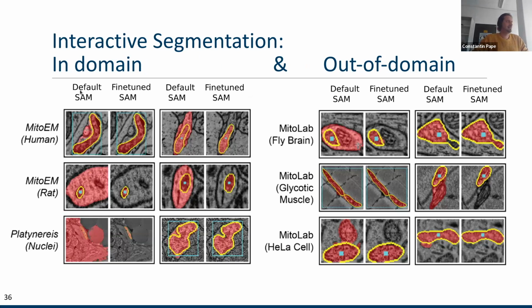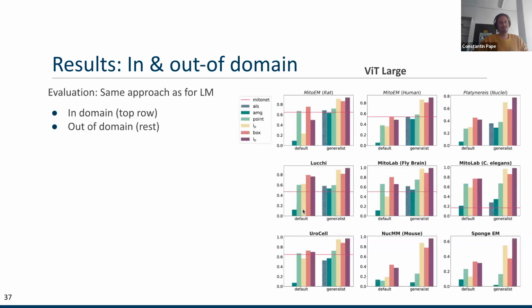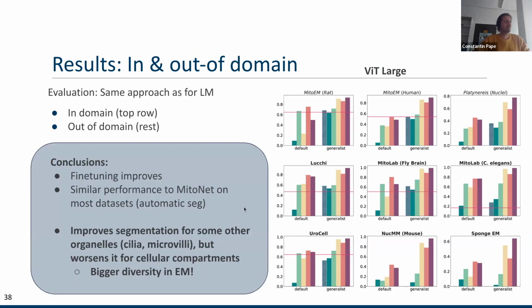And here you can see this again qualitatively. So these are the results before fine-tuning. These are the results after fine-tuning. We again see quite an improvement. And then if we look at the numbers for this, they are quite similar, showing that the model improves clearly for the mito segmentation after fine-tuning. So a similar message as for light microscopy. I will not dwell on this too much, just to say that currently the EM model we do have is fairly specific. I think we also trained it for nuclei, but it really only works well for mitochondria and for nuclei.